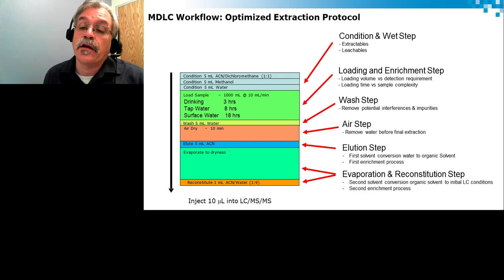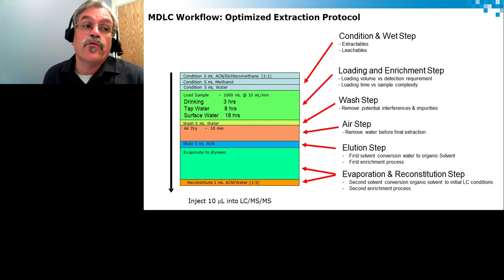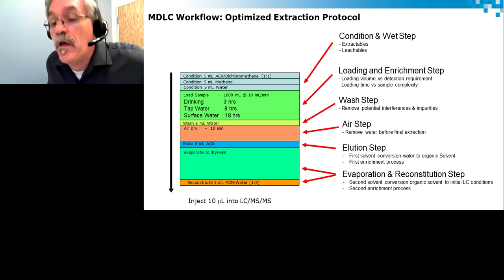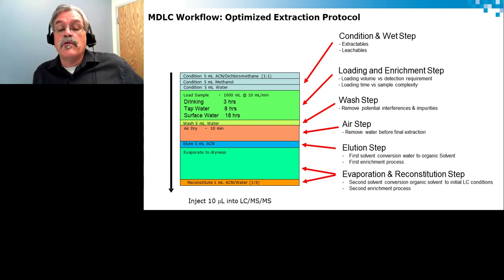There are actually several techniques to do that. We can use a standard reverse phase mechanism. There's also ion exchange or even mixed modes. With a polymer-based SPE, we can utilize what we call an air drying step to remove all water molecules out of the final extract, so that we can do a much better and more efficient elution. At the same time, it would reduce the amount of time to evaporate the organic layer and reconstitute in an initial mobile phase.